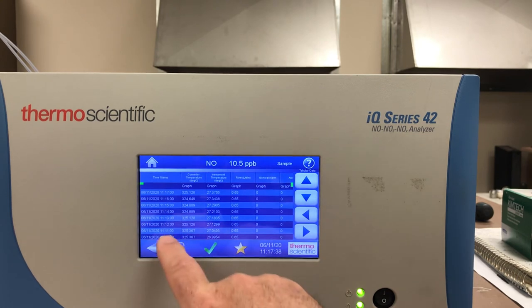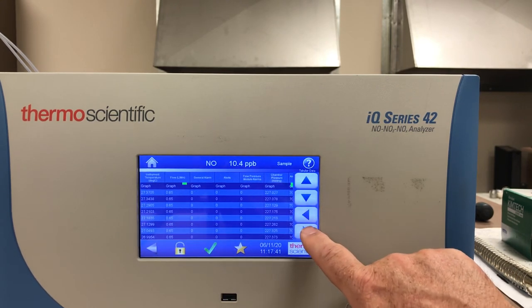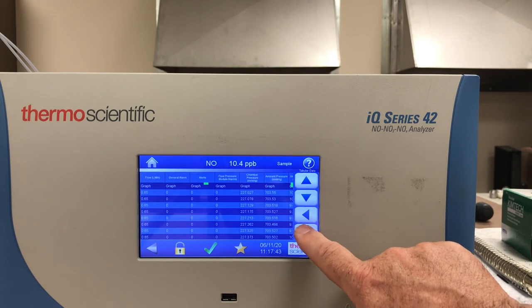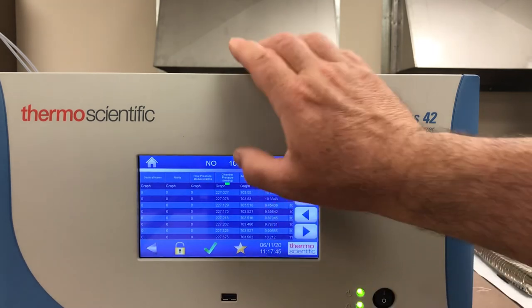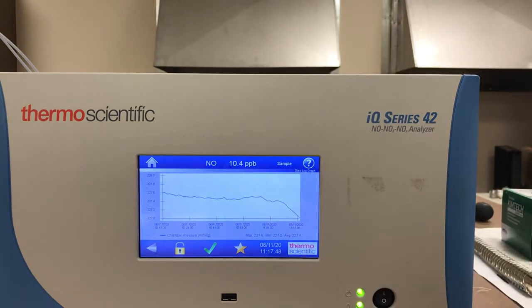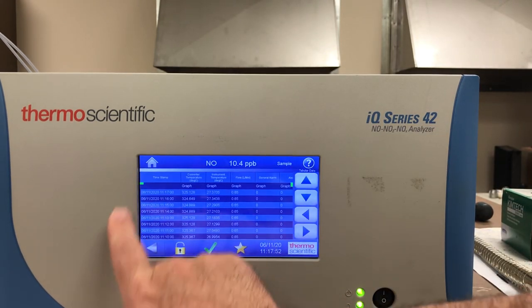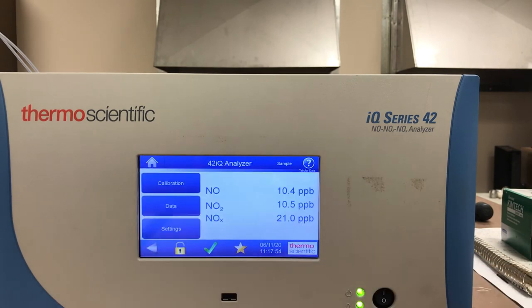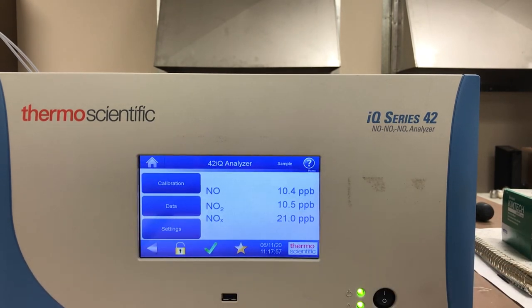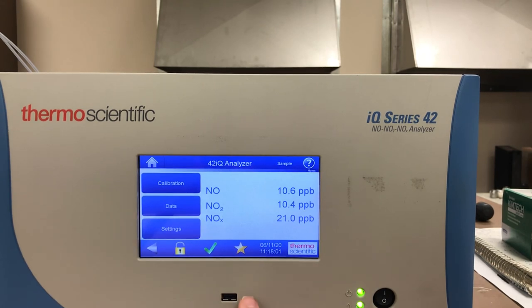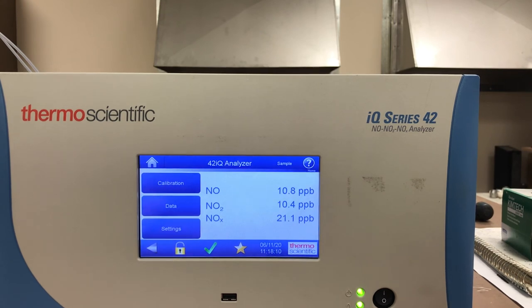I can press the right arrow and look at all the other data points — you can set up lots of other data points as well. Here's a pressure graph, for example — a quick snapshot of the data. You can also hook e-Port to the instrument to download data from the back panel Ethernet port, but it's not necessary. If you have a USB stick, it's much quicker to connect it to the front panel USB port and download the data straight to that stick, which you can then open with a spreadsheet.